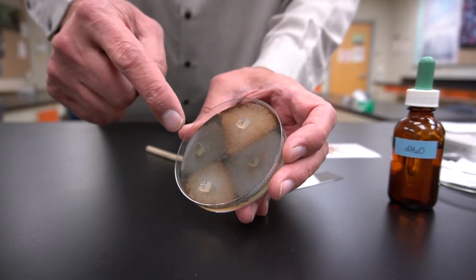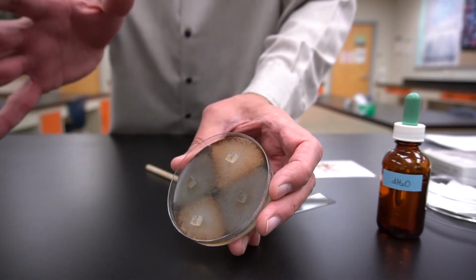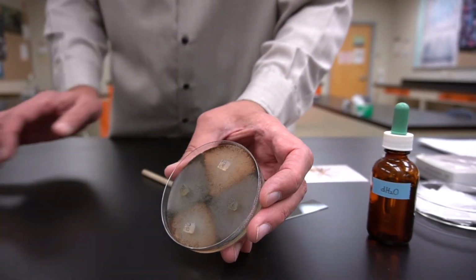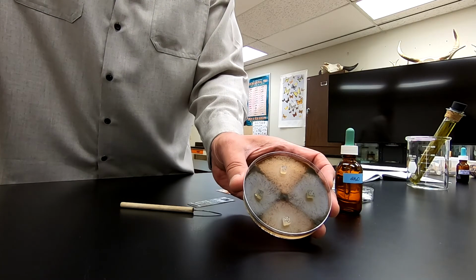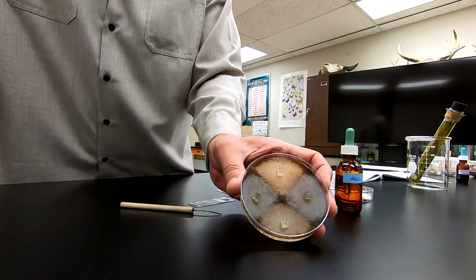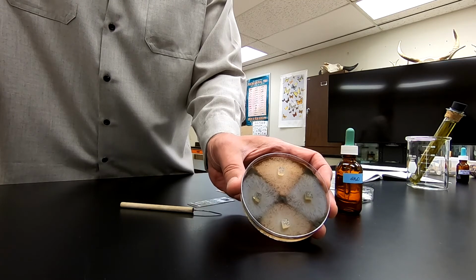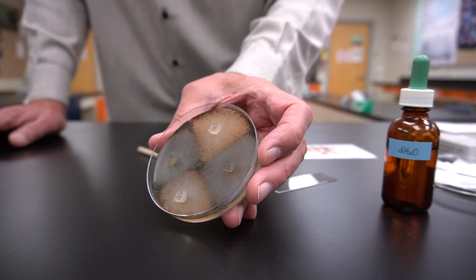And so what's happening is that from this block, the mycelia are growing out in all directions. And when they meet, you can see there's a color boundary. And at that color boundary, the haploid hyphae find their mate, form a zygote by fusing their haploid nuclei, and then immediately undergo meiosis.